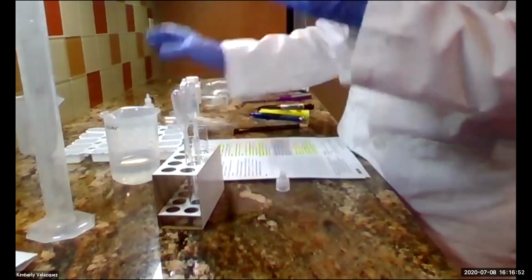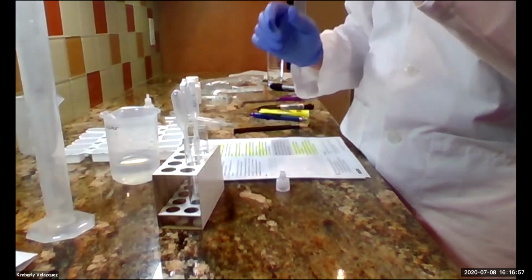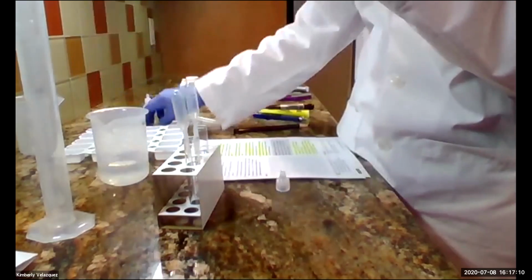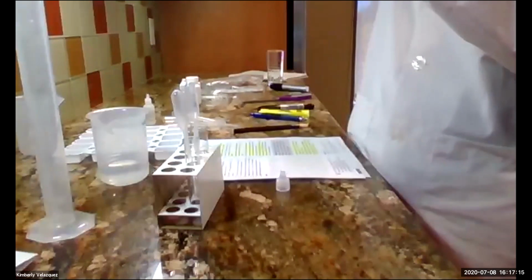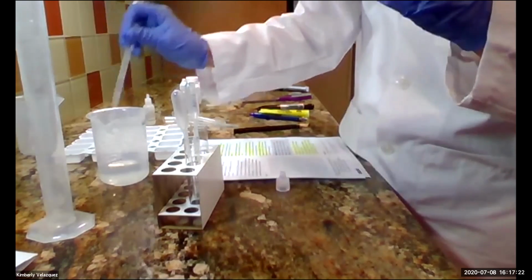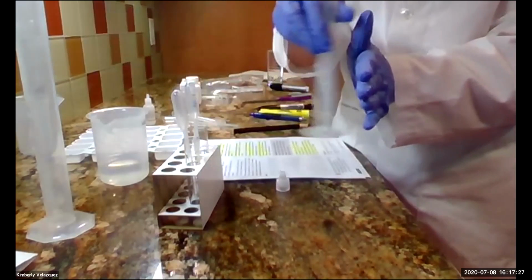Okay, and then I'm going to add enough water to get to 12 milliliters. So I'm going to take my water and add enough to get to 12 milliliters. What I'm going to do is get to 10, and then use the pipette labeled water, and now I'm going to add enough to get me to 12. Okay, now I'm going to take this diluted hydrochloric acid and mix it by gently tapping it against my hand.